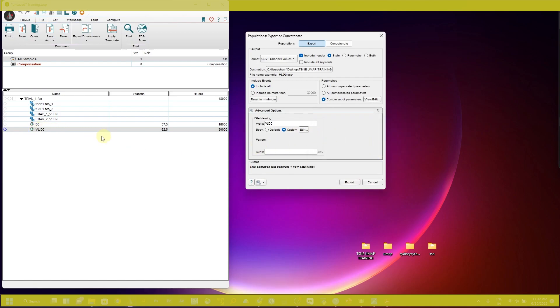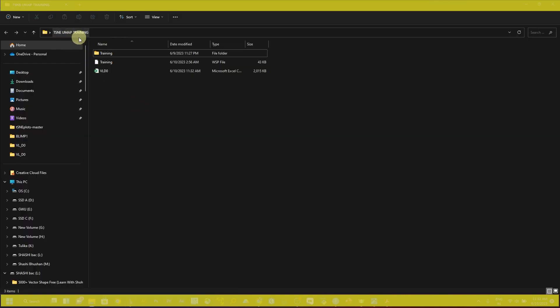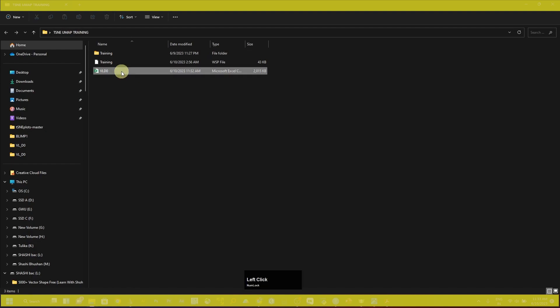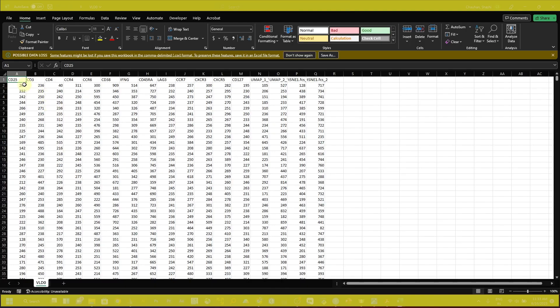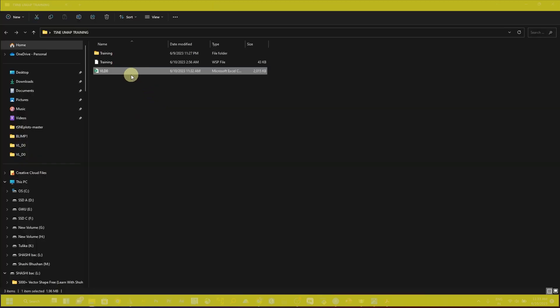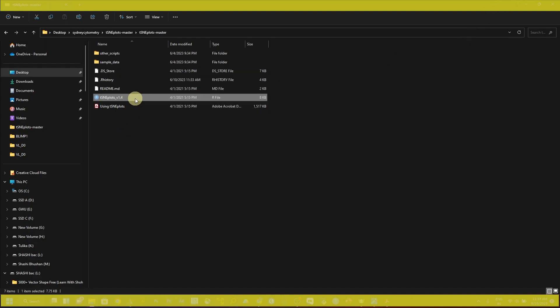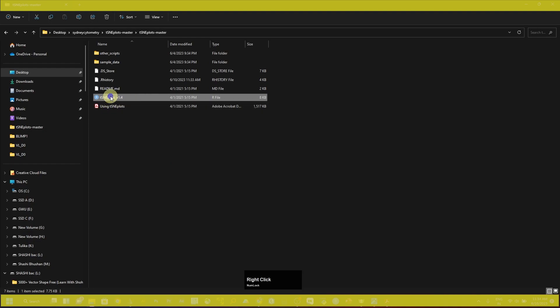I have exported VLD0 and you can also export other groups. In my folder you can see the VLD0.csv file is present. If you open it, it has all the values of your parameters as well as the UMAP and t-SNE parameters. We are going to use this CSV file to transform our t-SNE plot or UMAP plot.